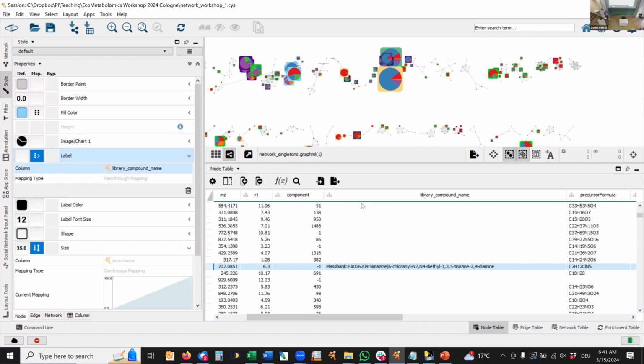All right. I'm going to start with the compound that was most interesting from my perspective here, because this is now a purely data-driven way to look at it, right? And I don't want to be biased by my chemistry knowledge. So I'm just going to pick the first one that seemed to be a xenobiotic that was highly ranked according to the random forest importance score, right? And this is here simazine.